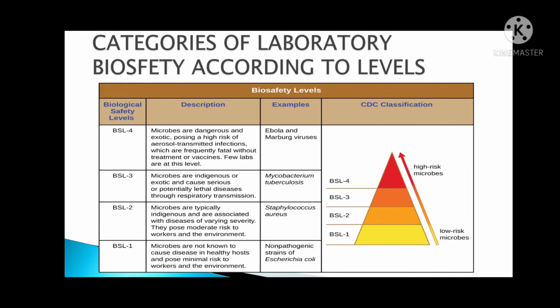The laboratory workers' complete isolation from aerosolized infectious materials is accomplished primarily by working in a Class 3 biosafety cabinet or in a full-body, air-supplied positive pressure personnel suit.